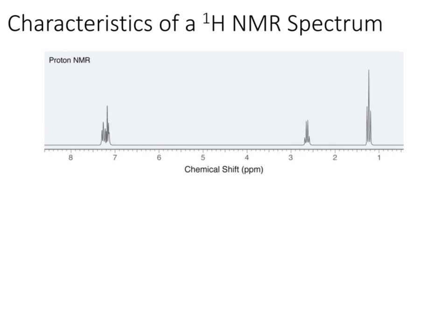Hello everyone, in this lecture we are going to look at proton NMR spectroscopy, which is a super useful and powerful tool to help you identify the structure of certain organic molecules. What you are seeing on this screen is a very typical proton NMR spectrum. There are some peaks going up, right? Signal going up, and you see the numbers at the bottom of this spectrum going from lower number to higher number. It's the so-called chemical shift. Usually you will see the ppm right here. We'll explain what those are later on.